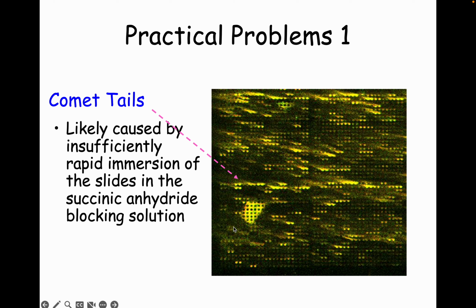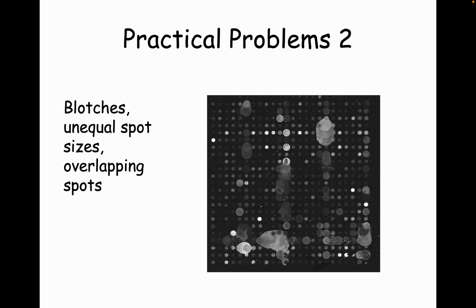You can get areas where something bizarre happens and the background is really high. Like look at that spot down there. That's crazy. But the foreground, which are the little spots, are almost black. You can get blotches. And a blotch is just going to be a place where, if you're reading this out with an antibody, a little pool of that antibody binds.